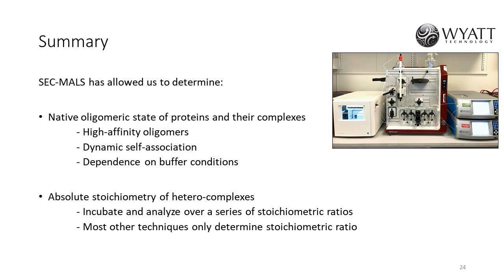What are the other parts? Have you confirmed? Have you considered? These complexes exist in solution. There are a couple of papers out there with in vivo as well as in vitro work with the Nap-histone proteins. And we have not actually considered composition gradient SEC-MALS, but we could.